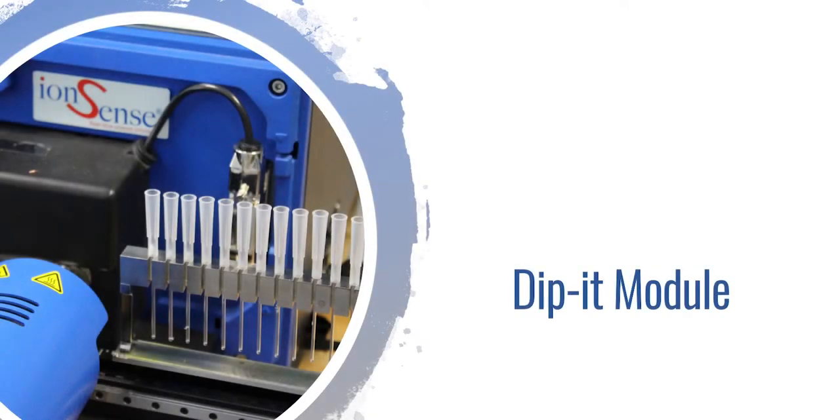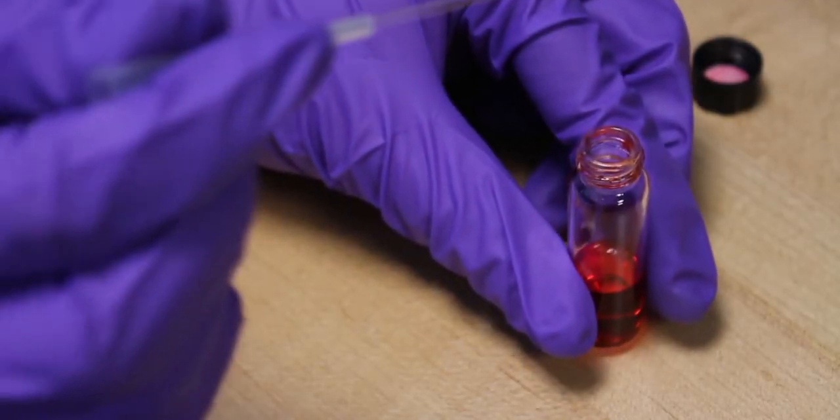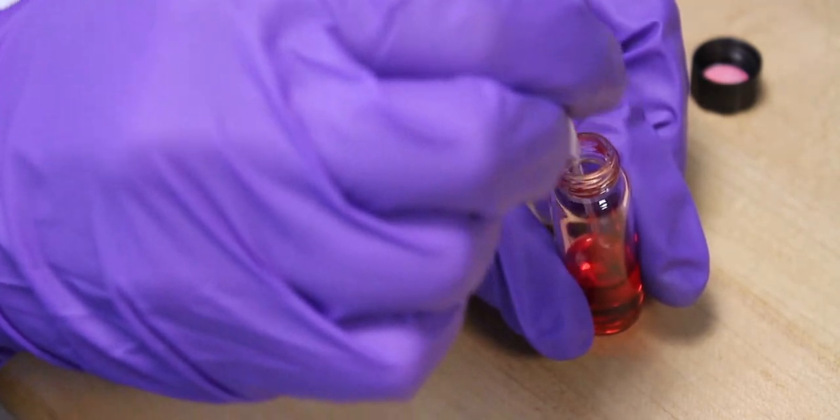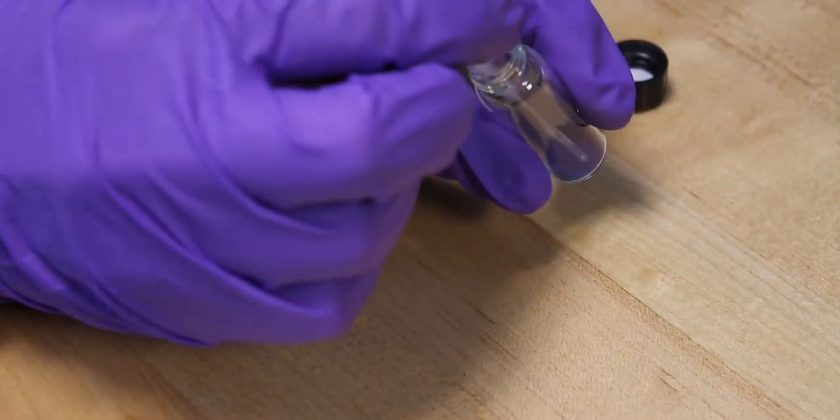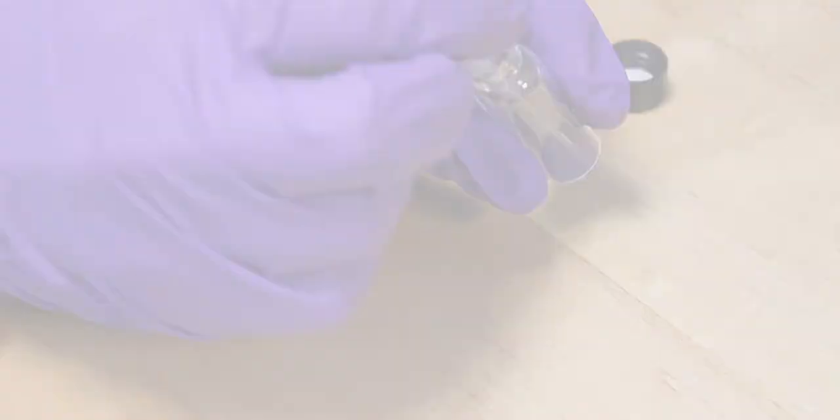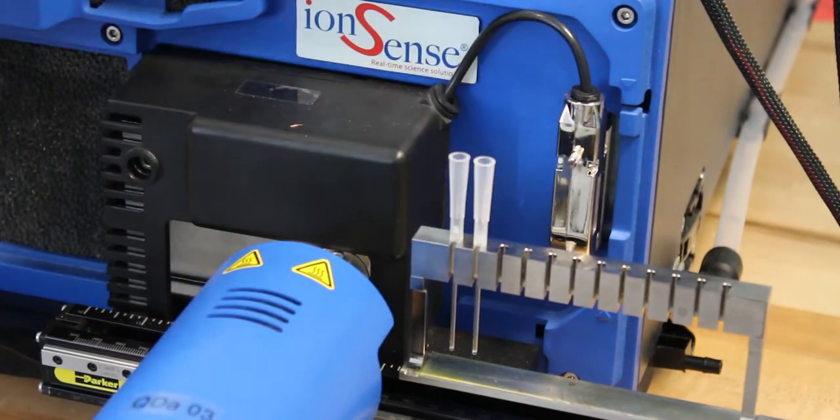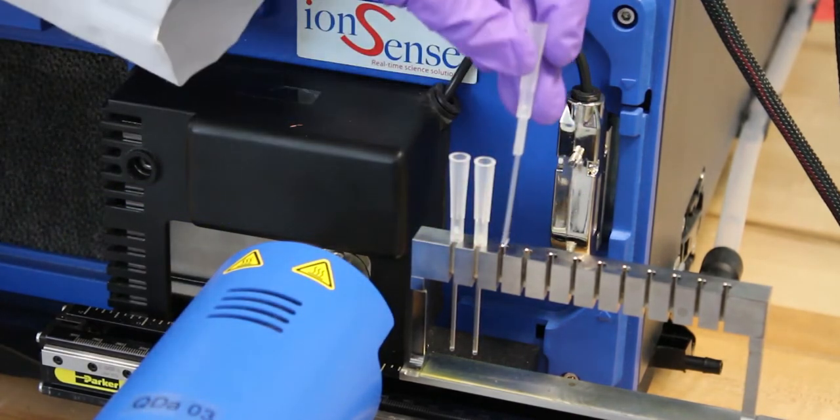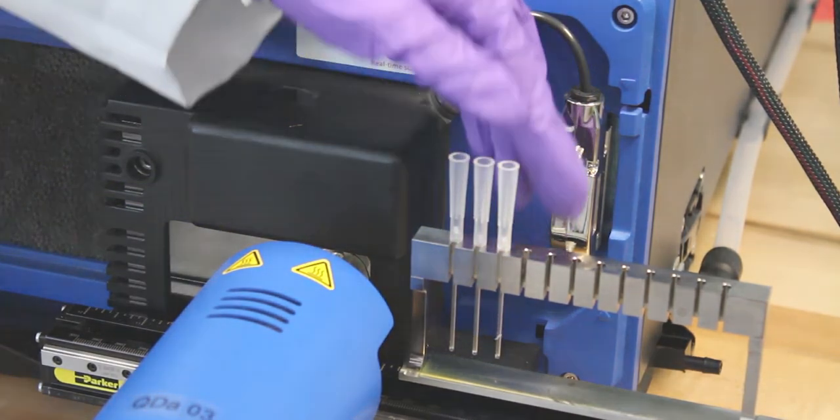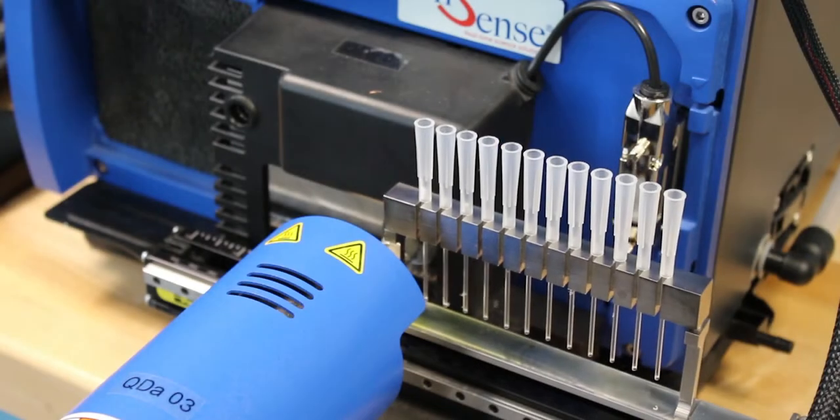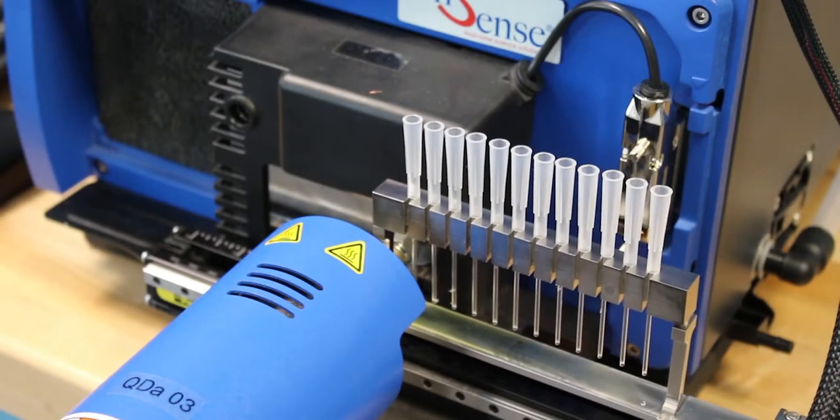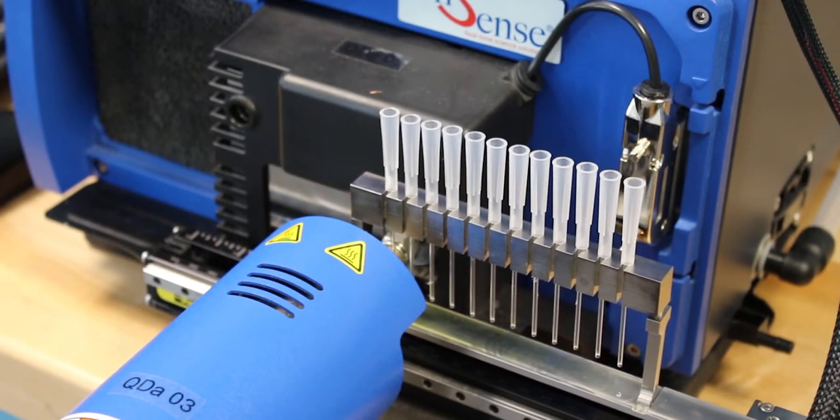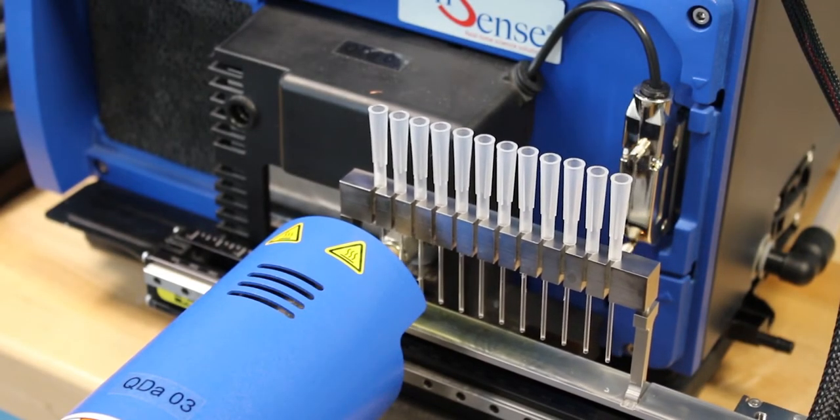For solid and liquid samples, we also have our DIPIT module. These glass capillary-like rods can be dipped directly into a liquid sample or a powdered sample. The DIPIT is then slid into the DIPIT module holder, where up to 12 DIPITs can be placed at a time. This module also moves through the DART-MS inlet at a user-adjustable speed.